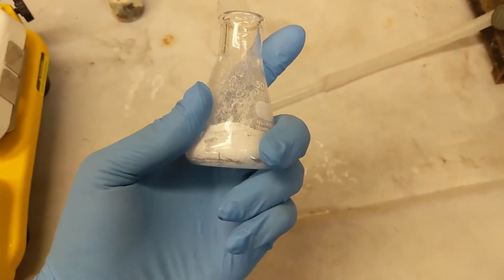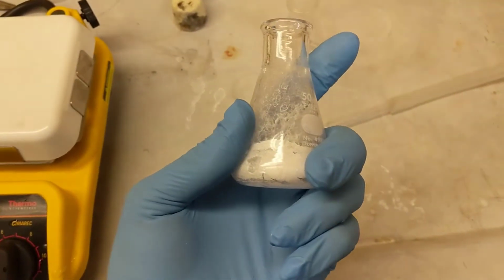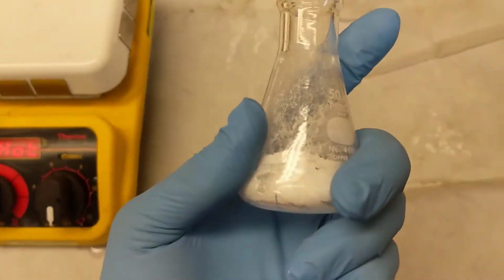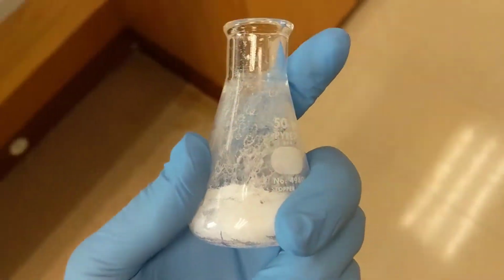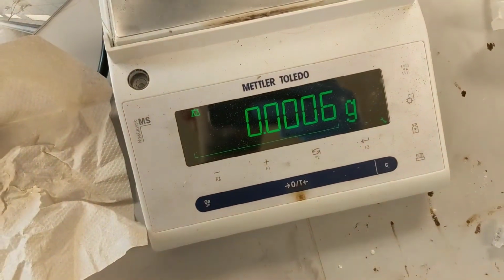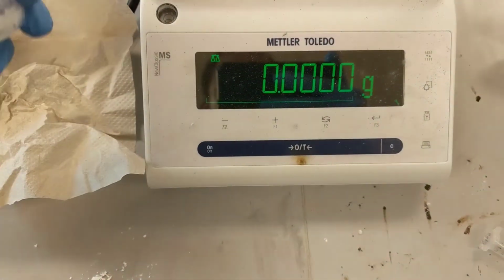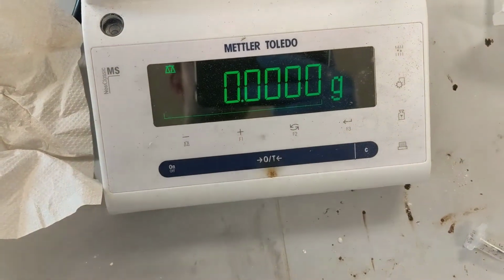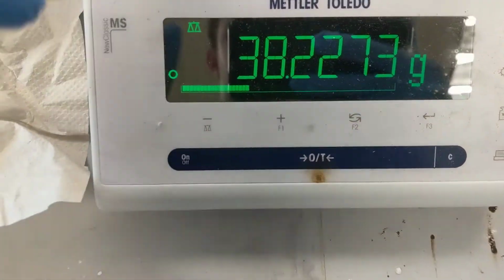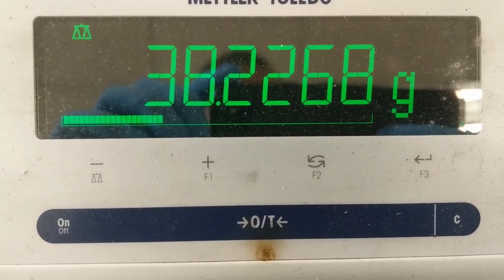Alright guys, here is the flask after evaporation. As you can see, it looks like the caffeine that we took in the beginning. So now we're just gonna go tare our scale, place it on the scale. There you go.